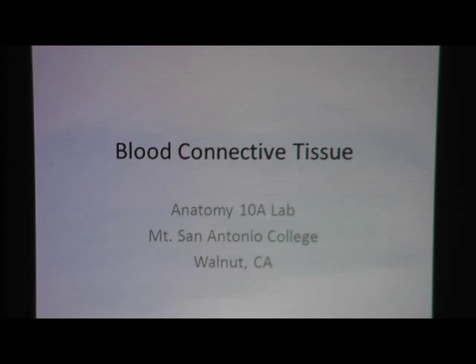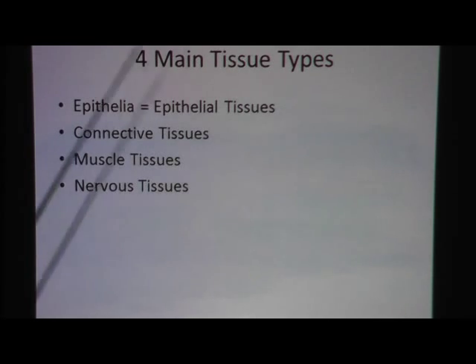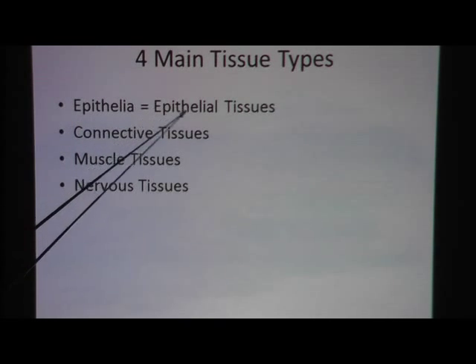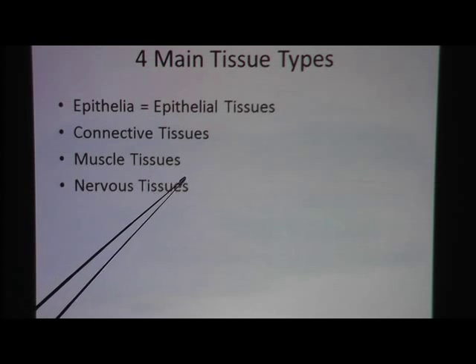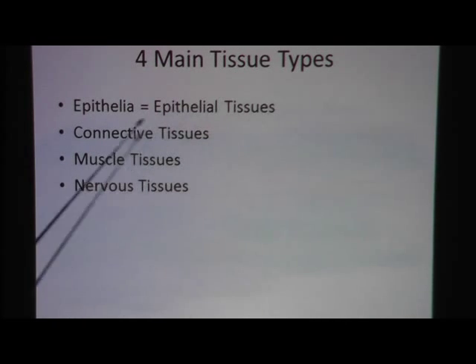Blood connective tissue. These slides are made for Anatomy 10A lab at Mount San Antonio College. The four main tissue types that we have in the body are epithelial tissue, connective tissues, muscle tissues, and nervous tissue. Right now, I'm going to focus on connective tissues.